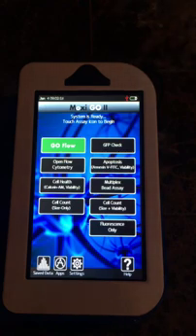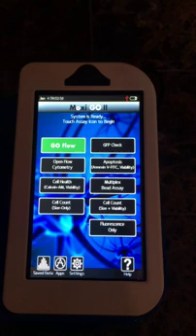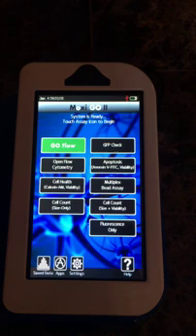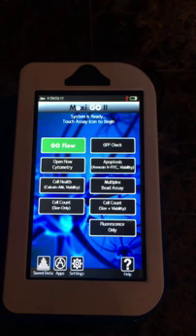The other really nice feature of the instrument is that we've tried to enable cell analysis and flow cytometry in a simple package that requires virtually no prior experience with flow cytometry. We've pre-programmed all the applications so that they're basically touch and go, limited to the key apps that our current customer base uses the instrument for.